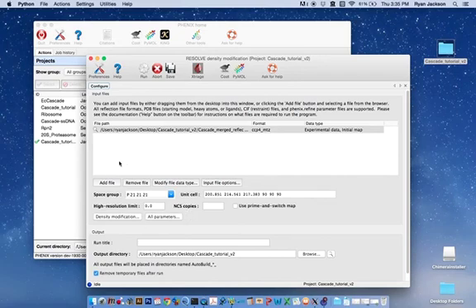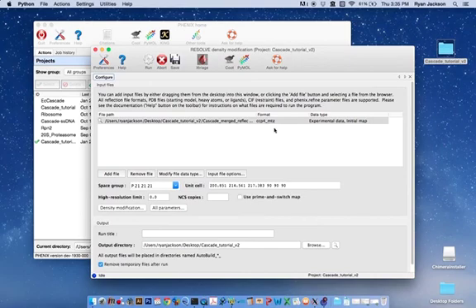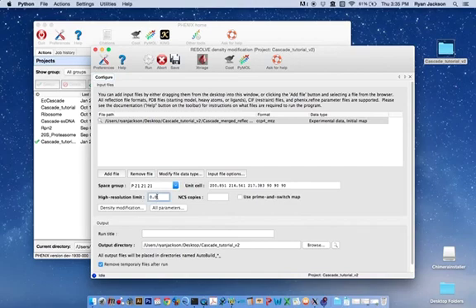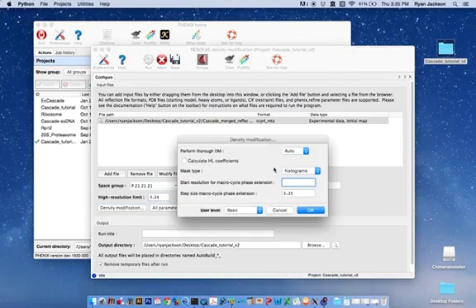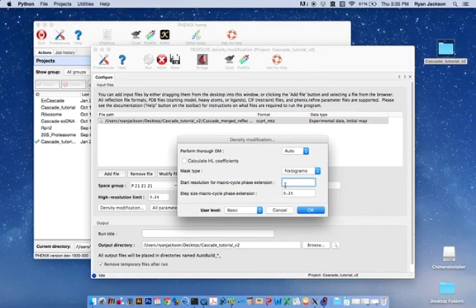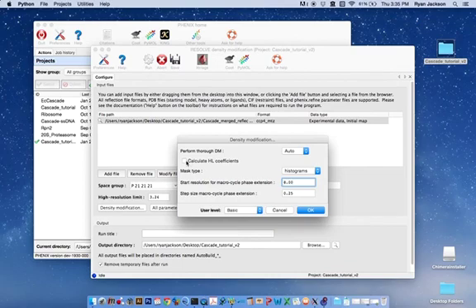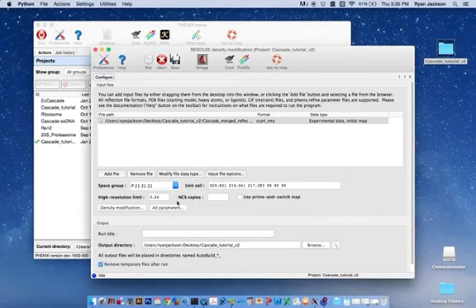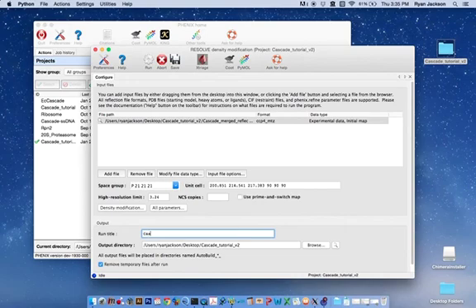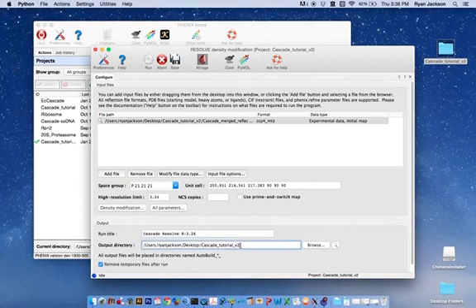Now, what we want to do is work in macro cycles of 0.25 angstroms starting at 8 angstroms and working down to 3.24. Here we need to say that the high resolution limit of resolve we want that to be 3.24 and then here in the density modification button we want to tell resolve what resolution we want it to start these macro cycles. We want to start the macro cycles at 8 angstroms and we want to step in 0.25 angstrom macro cycles. Now, we want to give it a run title. The run title that I'm going to use is cascade resolve from 8 to 3.24 and we need to give it an output directory. I think we're ready to go.